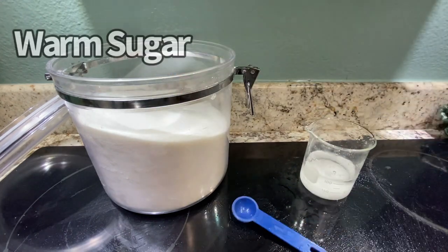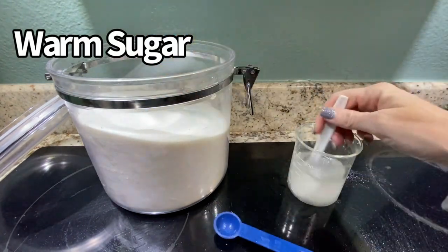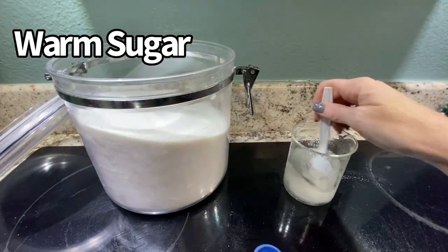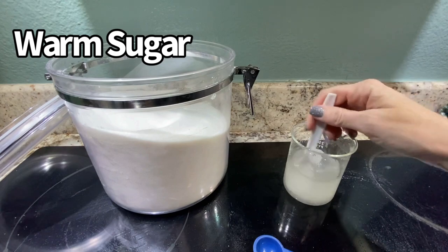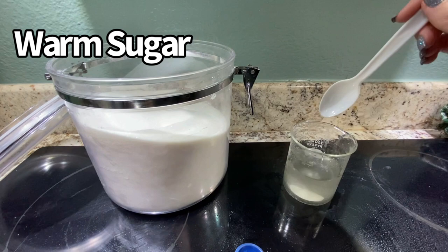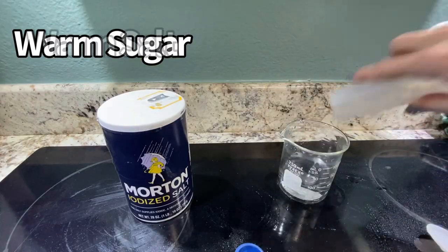Now 75 degree water — for sugar: 5, 10, 15, 20, 25, 30, 35, 40, 45, 50, 55, 60. And 60 milliliters of sugar dissolved in the warm water.